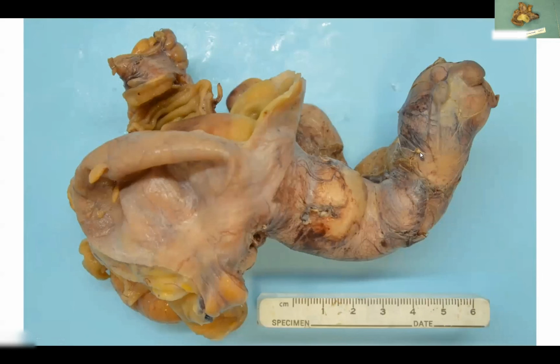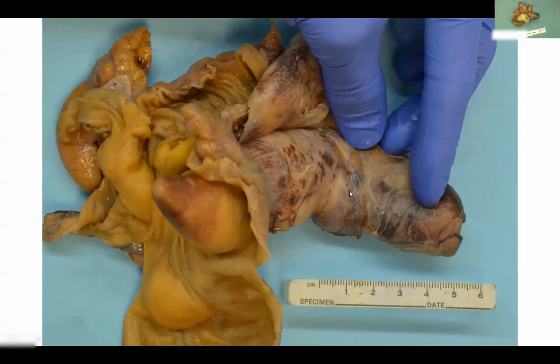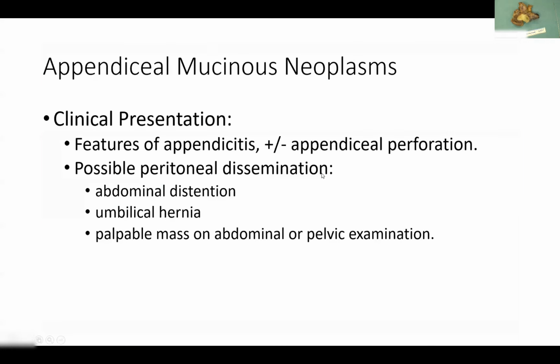The fibrous adhesions, which point to this being a chronically inflamed process, as well as the importance of inking, because we'll discuss what that means later on, giving you this kind of brownish hue with a silver application to this serosal surface. A close-up view of that mucosal projection, which again, in all likelihood, is probably mucin. I think that's the reason, yeah, at the orifice. At the appendiceal orifice, just a close-up view showing all these adhesions on the serosal aspect.